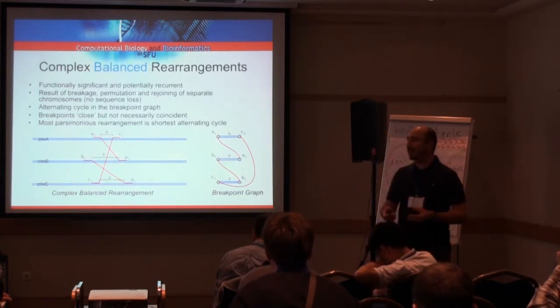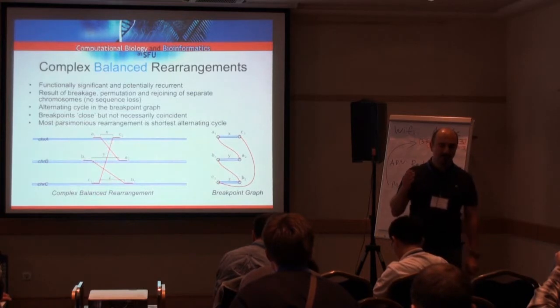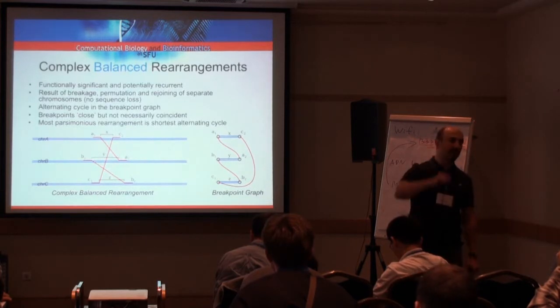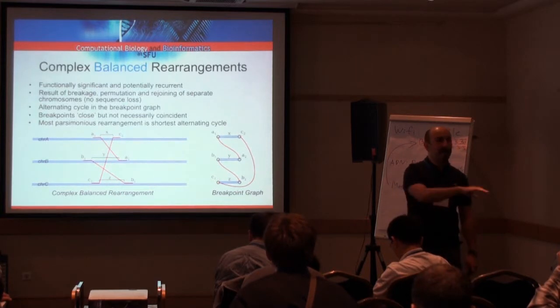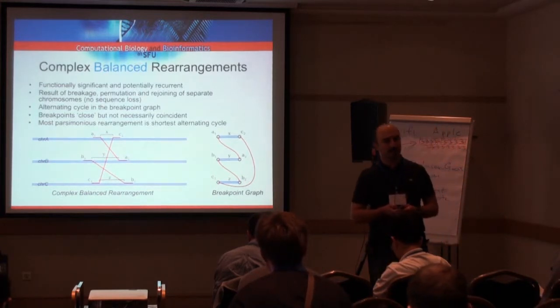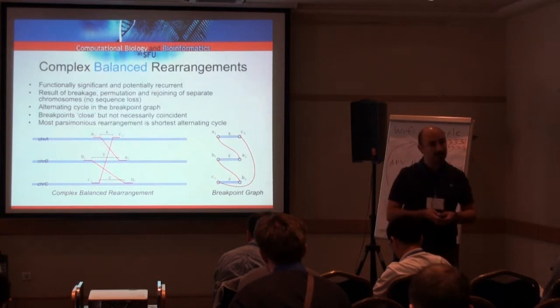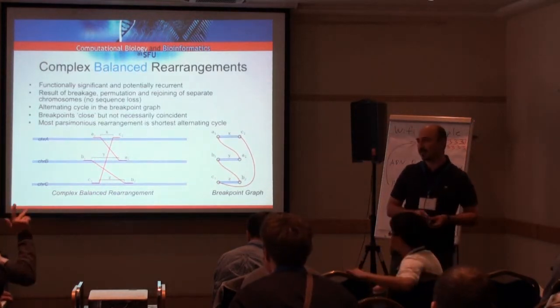So I'll just come up with a number, because when I say false negative rate, it's not a real false negative rate. I'm sure that we are missing even more than this. But our false negative rate among the events that we know are happening stands around 10%, maybe a bit more than 10%. So some of them must be due to overlapping SV events. I don't know if it's an answer.